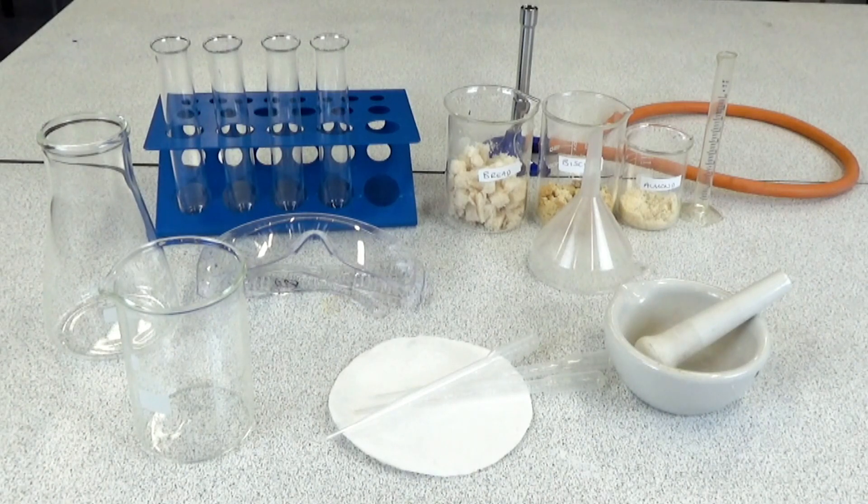For this practical you'll need some test tubes and a test tube rack, a Bunsen burner, a selection of different foods, a 10 milliliter measuring cylinder, filter funnel and filter papers, some goggles, a pestle and mortar, disposable pipettes, a 250 milliliter flask and a 250 milliliter beaker.